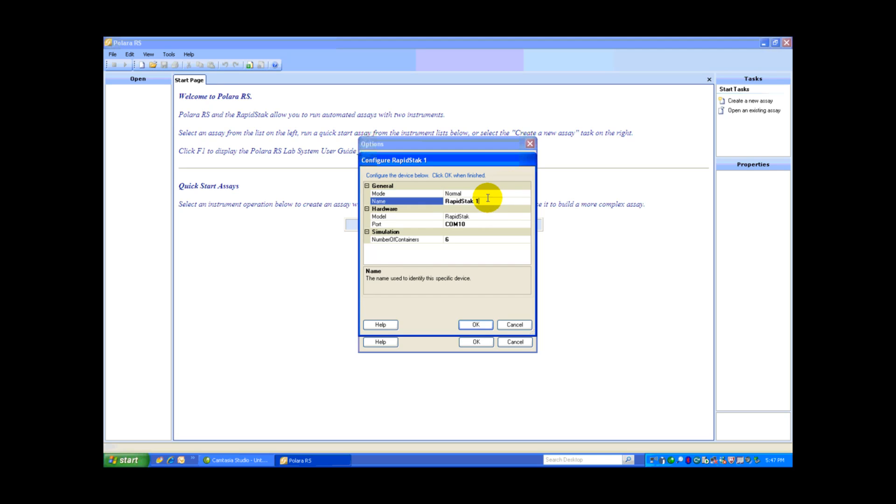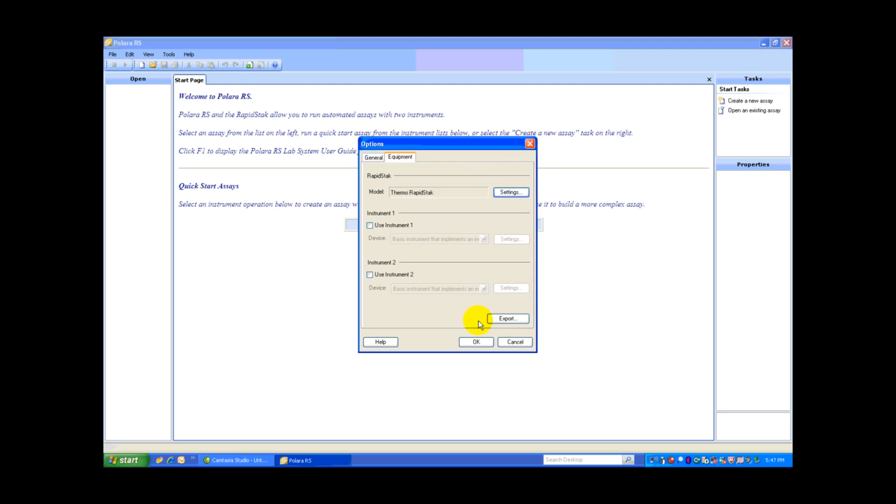We have to give our RapidStack a name. In this situation, I've given it RapidStack 1. And very importantly, we have to identify the COM port. I know that this RapidStack is on COM port 10, so I'm going to select OK.